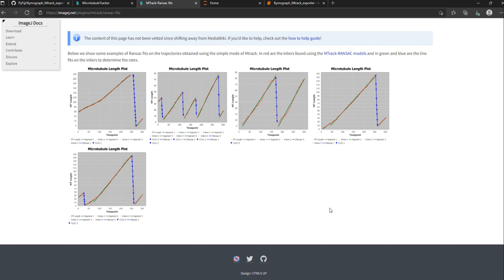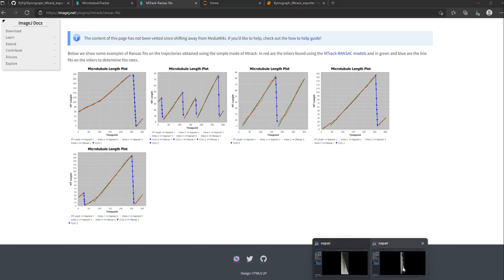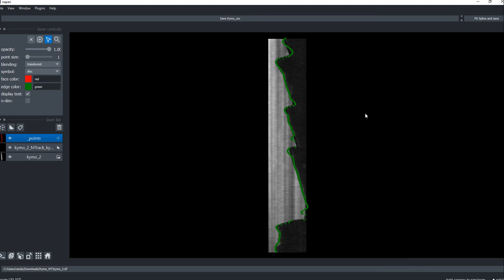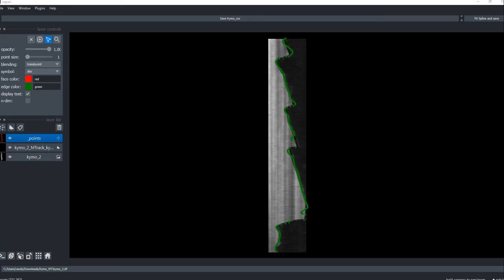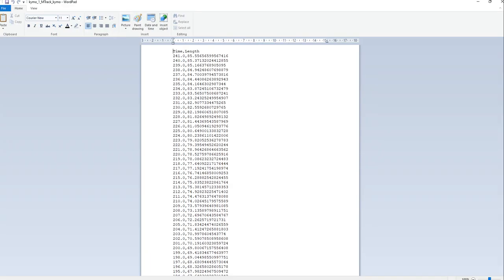And it's my suggestion that you could use this Napari plugin, but if you are happy to produce the CSV file in some other way, then that's also fine. What you have to do, irrespective of what tool you use, is make a file which has two columns, time versus length. The order doesn't matter, it could be increasing or decreasing order of time.